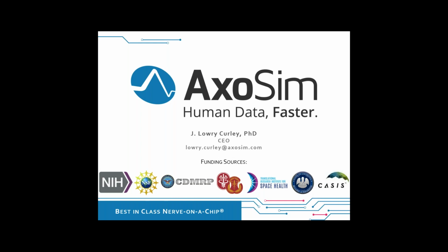Yes, there certainly are differences. There's a few different model systems out there, I think, of brain spheroids, however you want to call them. Part of it is in the way that they're differentiated, which, as I mentioned before, these systems are very sensitive. So you take it down one pathway, you're going to get different cell populations, different phenotypes of individual cells. And so the mini brains, what's nice about that is there's a large level of control over the reproducibility, and that starts with the size of the brain spheres. And this is a big differentiator.